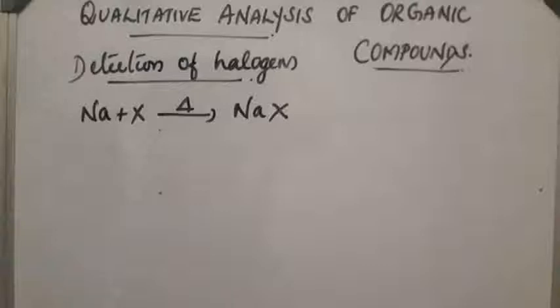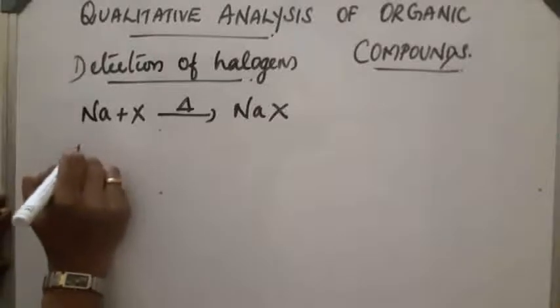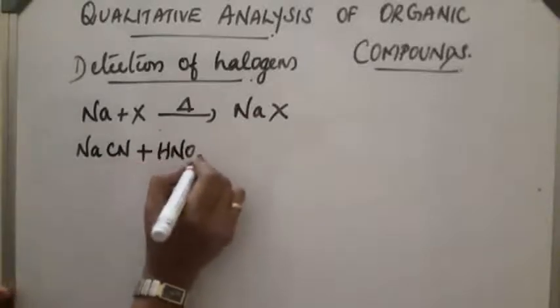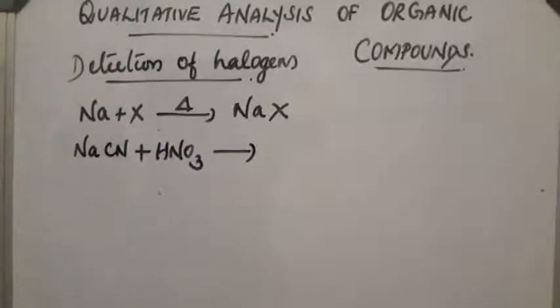For that, a portion of the extract is boiled with concentrated nitric acid. Cyanide ions and sulfide ions will decompose.